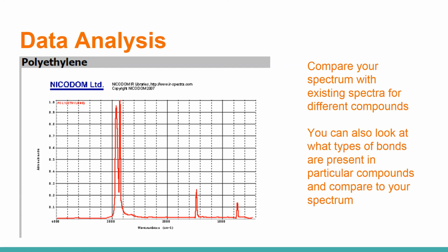Again, there's a Thermo Scientific book that's located in the FTIR room, which has a large set of spectra to look at. As well, NIST also has its own spectra you can look at as a standard. And so in this specific scenario, you realize that the unknown sample that Anwar gave to you must be polyethylene based on its simple carbon-carbon bonding. So you just vent the system, do the necessary steps to take out your sample and exit the program. Of course, you saved it and printed it, hopefully.